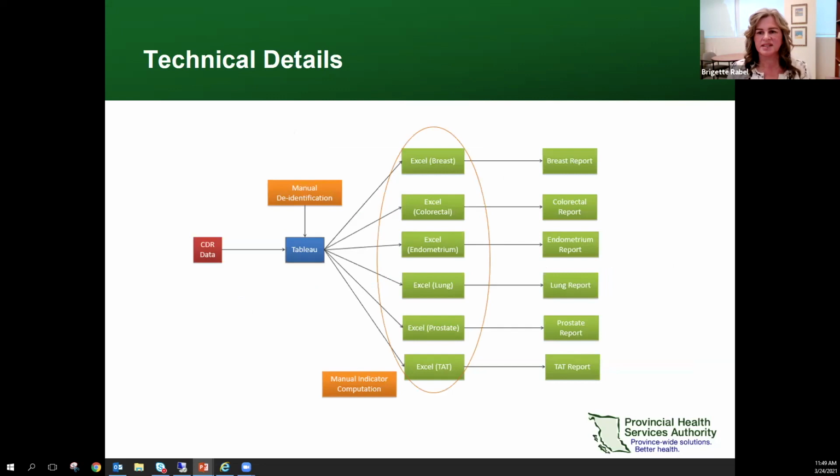So this slide is just to remind you of the manual process I showed you earlier. This process shows how I use Tableau to extract the raw data and I did my manual manipulations in Excel to create my reports. Gurpal's team expanded on this by creating additional tables, views, and stored procedures in SQL. Now all that data manipulation happens automatically in the background.